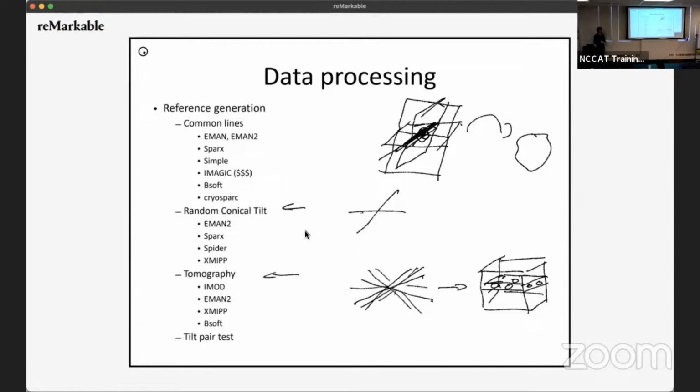When you do tomograms, you're tilting your stage, you have lots of movements as you tilt, you're trying to realign all the tilts to each other, there is doming at the same time, there are a lot of issues. And so your 3D reconstruction, your tomogram, is not necessarily as high resolution as you'd want it to be, and so the subtomograms also will not be at as high resolution as you'd want them to be.